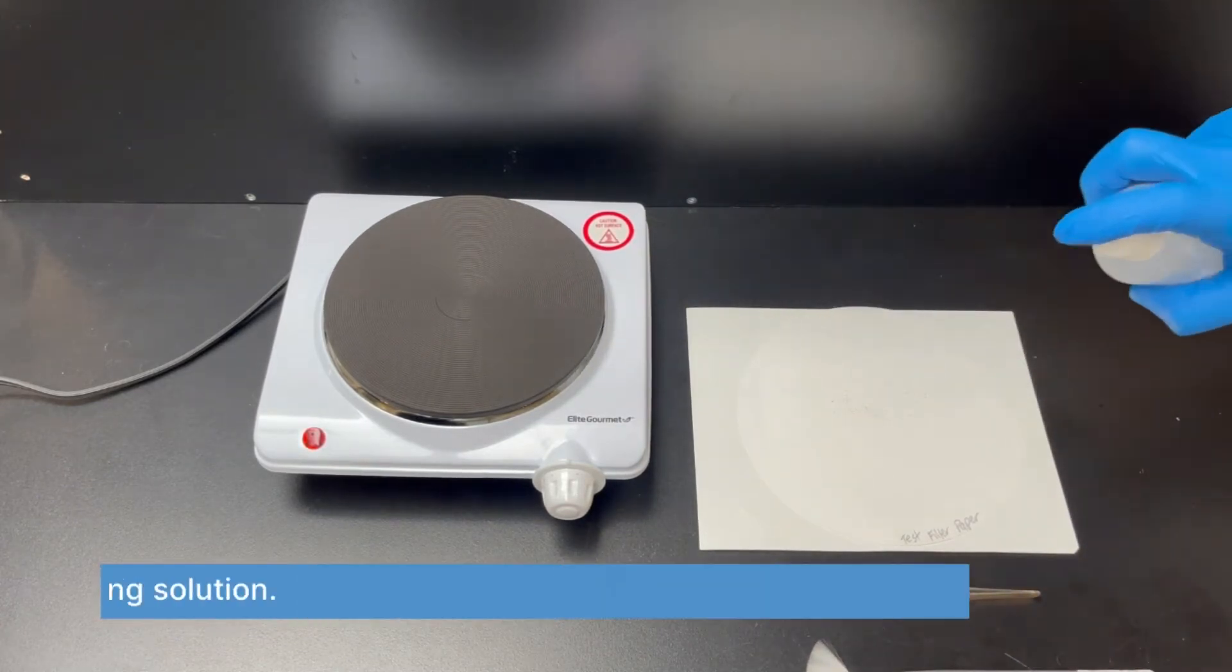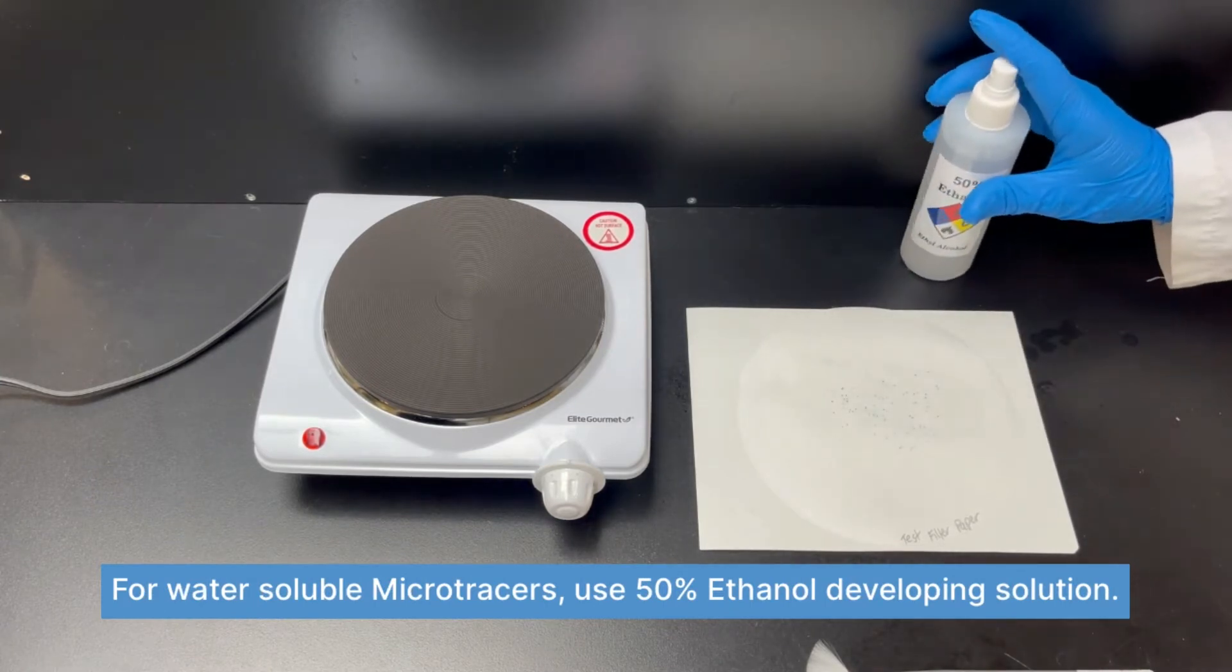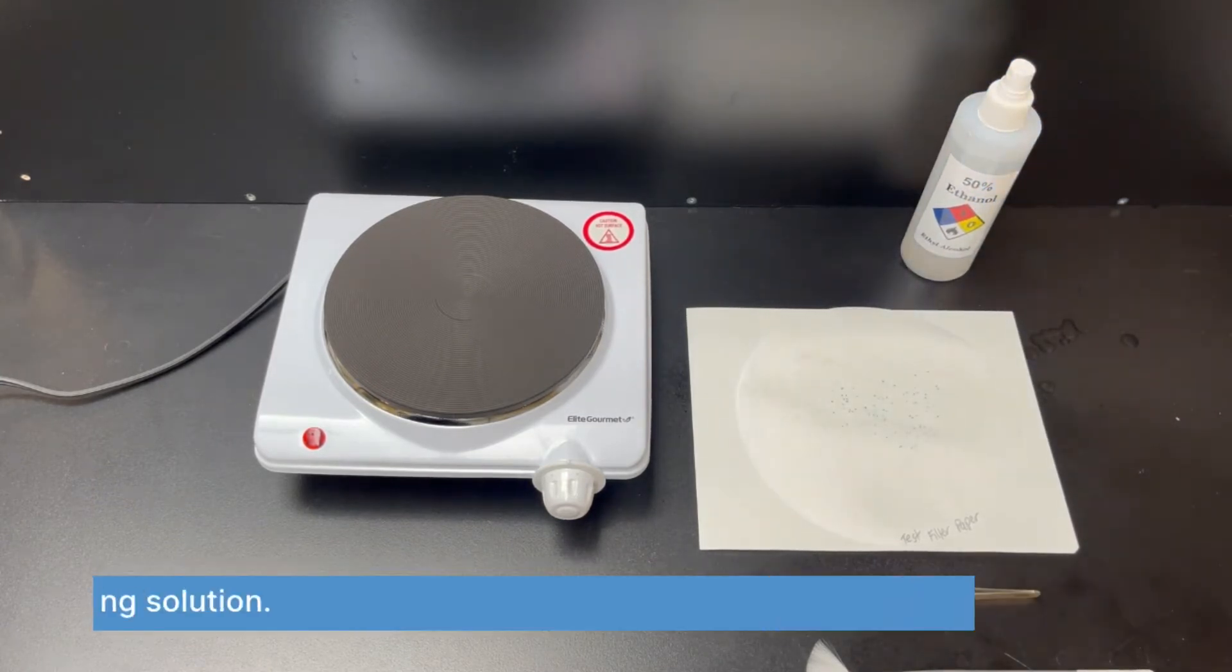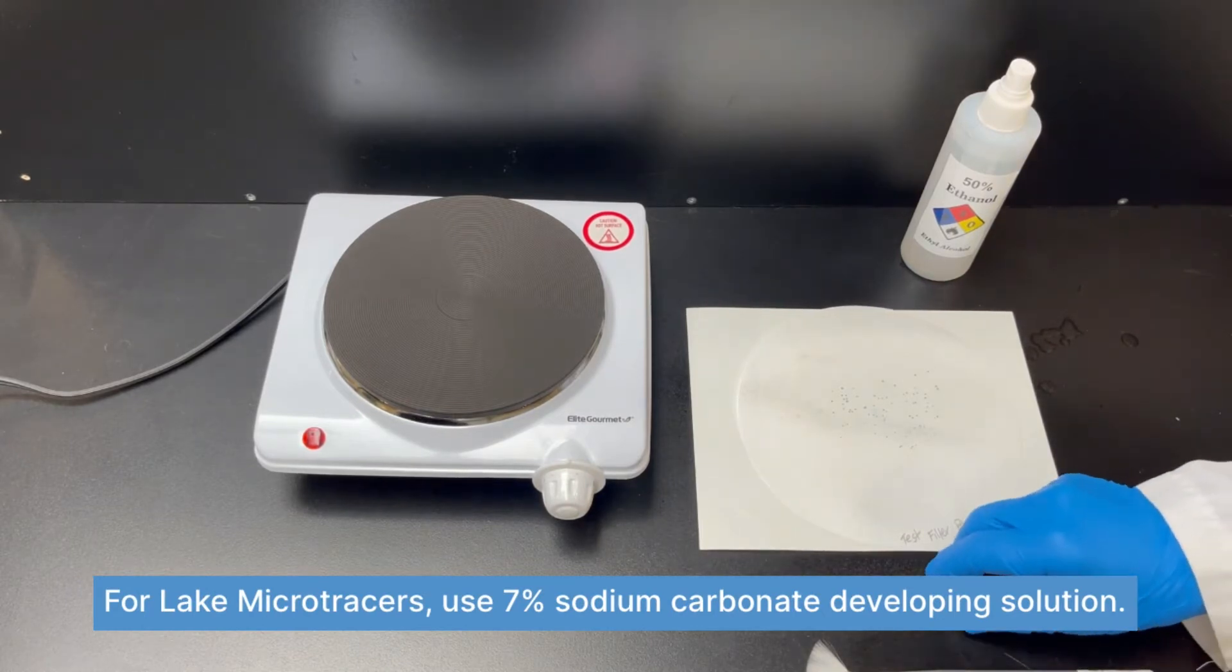For water-soluble dyes, use a 50% ethanol developing solution. For lake dyes, use a 7% sodium carbonate developing solution.